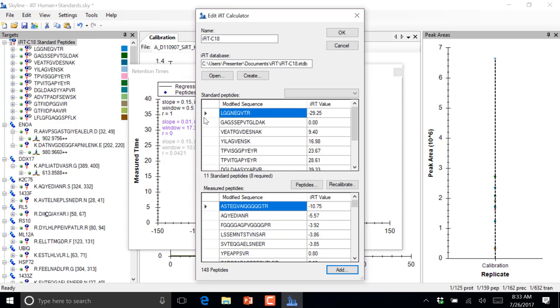You can create that library, and you will get less variance in your retention time prediction. Your retention time prediction will be a more powerful score for predicting where things are. But you have to realize that you're sacrificing some transferability. That will be a fine library to share with a friend, but it's not going to be as powerful for them as it is on your own column where you created it.